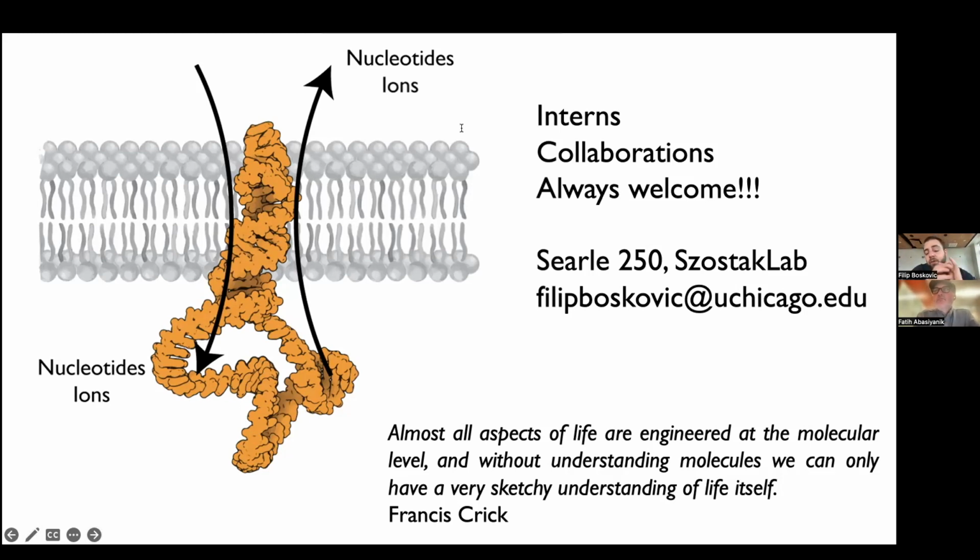So therefore you would lose, when we say 5' end, probably the last 10 nucleotides would not be read, or even maybe 15. So they have this 5' truncation, but you can definitely pick a shorter sequence. You can take 20 nucleotides or 30 that you know will be in all your samples of interest, and let's say others are just isoforms or variants, and then by that you can probably do adaptive sampling, but you need to give it a try.